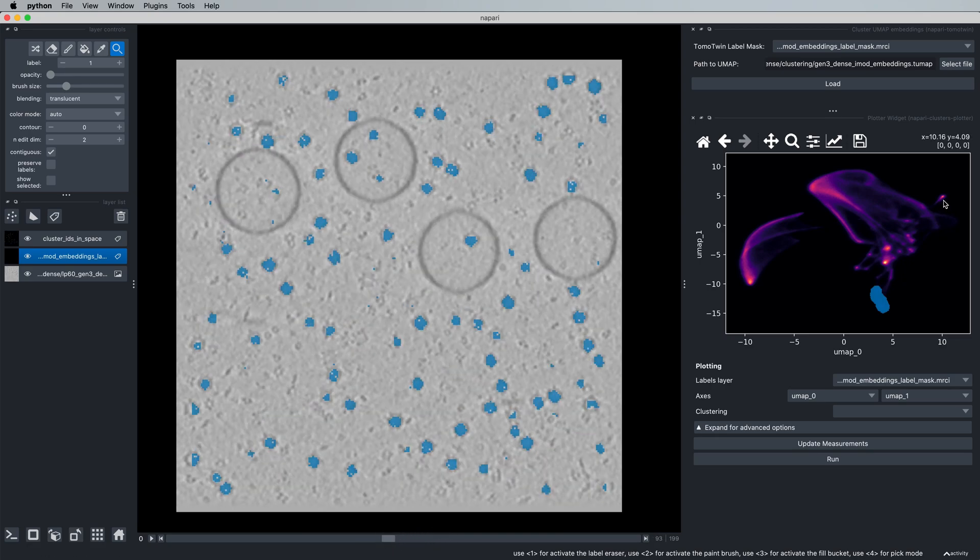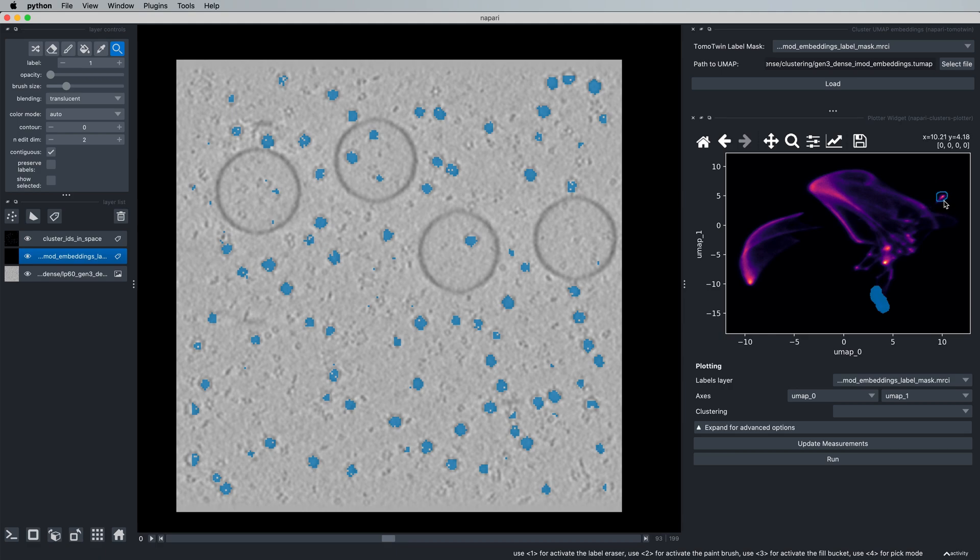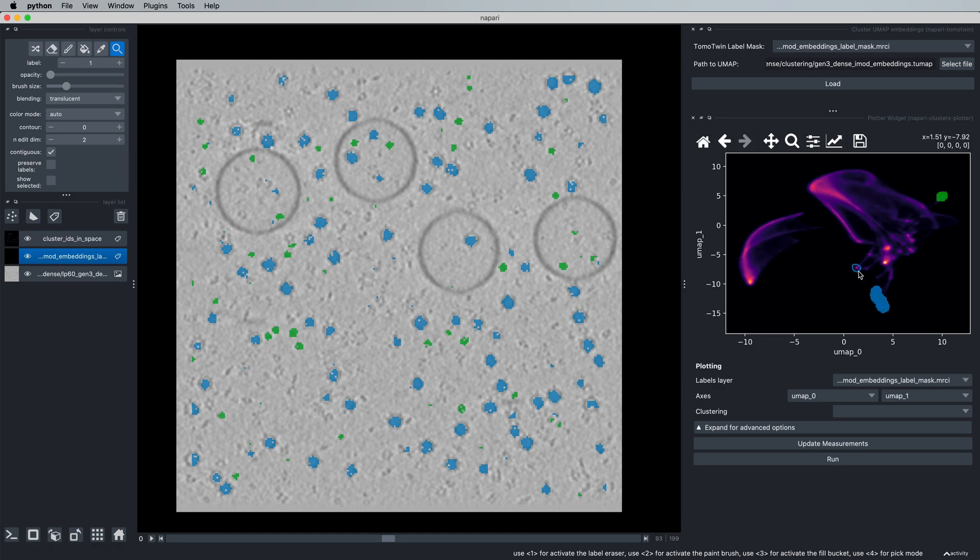If you hold Shift while doing this, you can select multiple clusters of interest to allow you to pick multiple proteins at the same time. Now we see a second protein, and I'll just draw a third cluster to give us three proteins of interest picked in the tomogram.